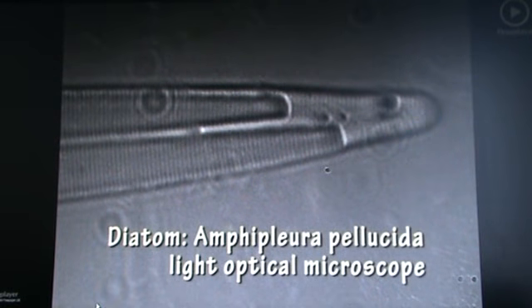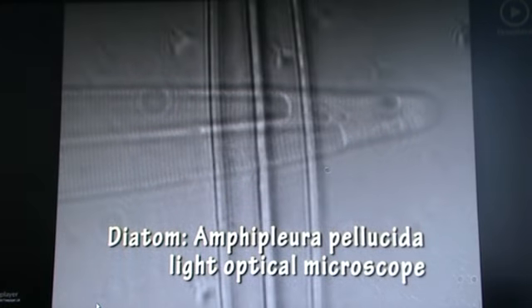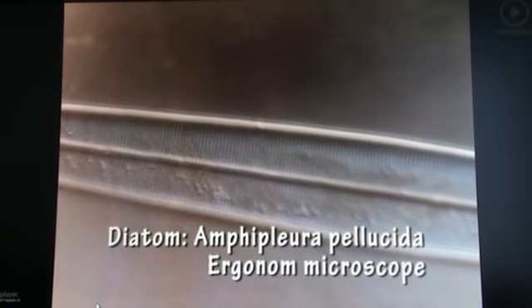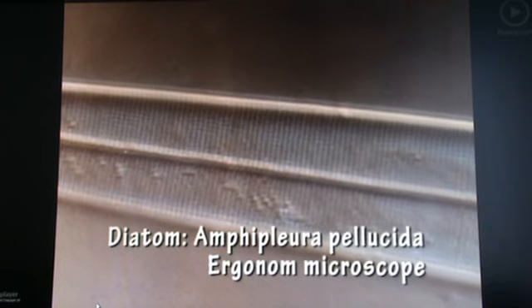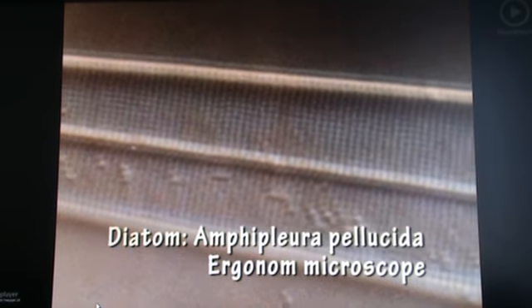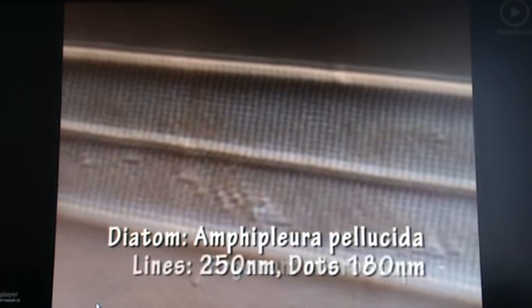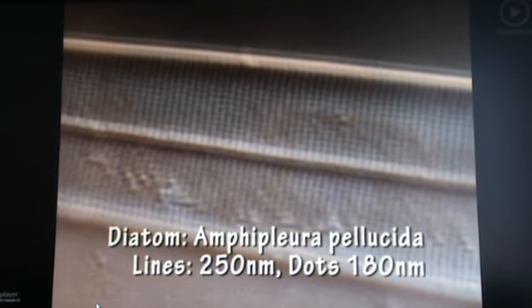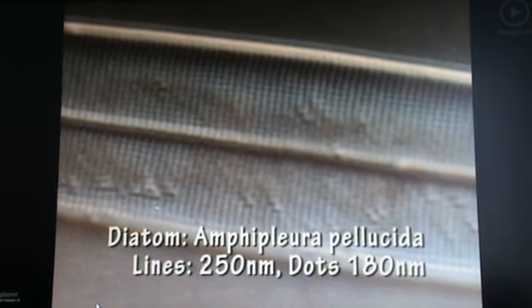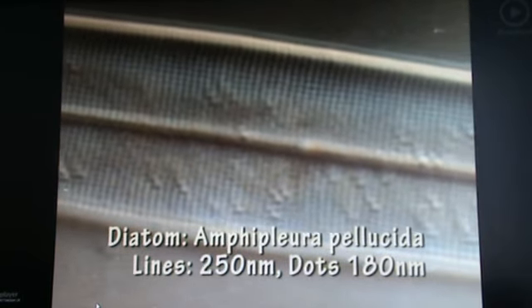The following is a comparison of various specimens as seen through conventional microscopes and the Ergonome 500, where special attention should be paid to the improved contour focusing, greater depth of field, the variety of the finest color nuances, and enhanced picture information at both a higher resolution and magnification.